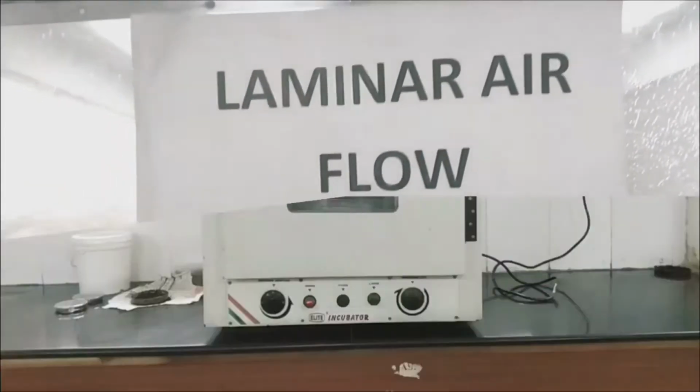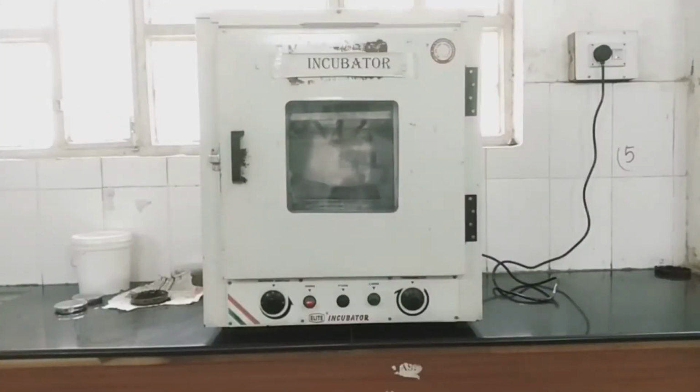Another important instrument is the incubator. This is also an important instrument in microbiology as well as in biotechnology, because in the incubator we provide an optimum temperature for the growth of microorganisms. Different types of microorganisms require some optimum temperature for their growth, as bacteria require 37 degrees Celsius, and fungi require different temperatures. So we have to give the particular temperature to microorganisms to grow them. That's why we use the incubator.